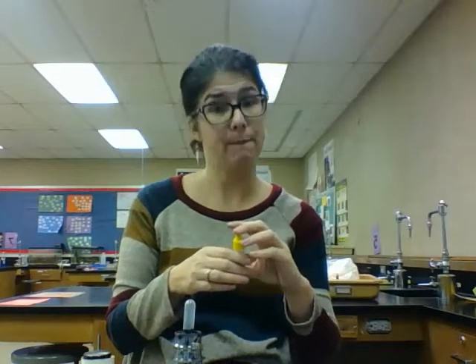Iodine is another common stain or dye, and what it does is it binds to starch molecules, and hopefully you remember that from your biomolecule lab. When it binds to the starch molecule, it makes it darker. In plants, they have these organelles called a leucoplast. It sounds like chloroplast, but the leucoplast actually stores starch molecules. And since the plant is undergoing photosynthesis and producing all these glucose molecules, plants tend to have quite a bit of starch in them, and some more than others.